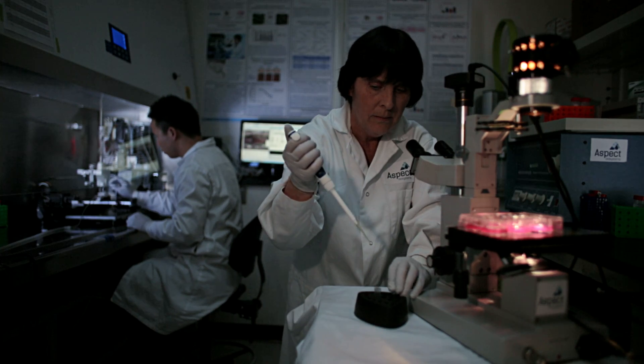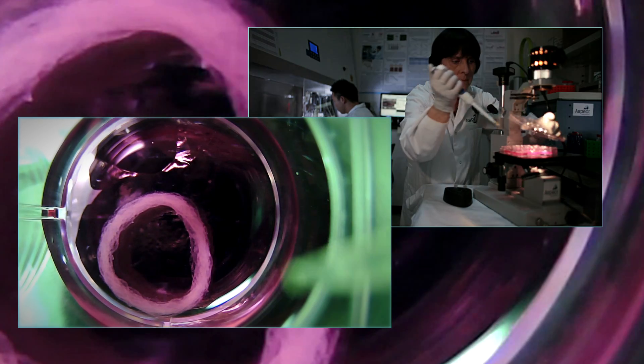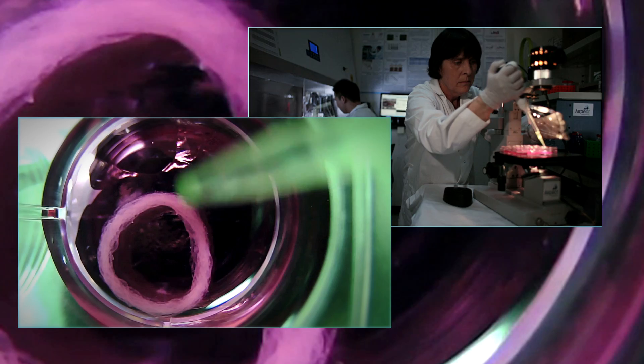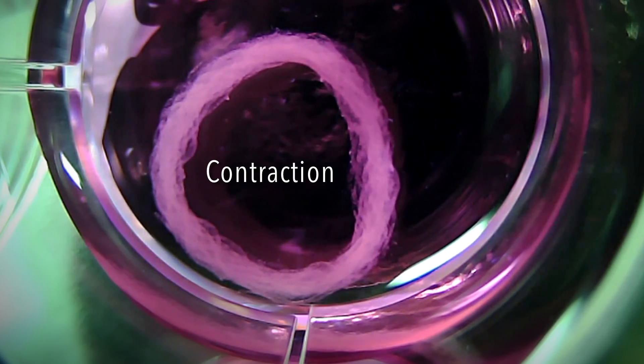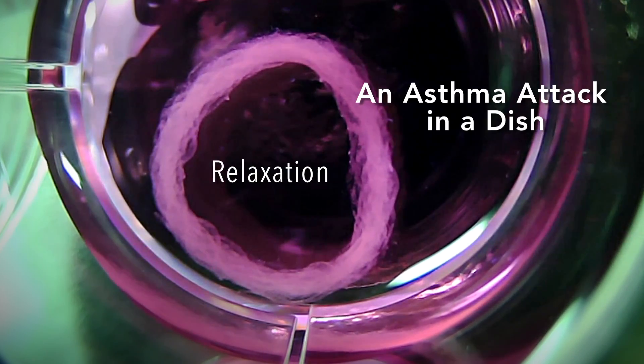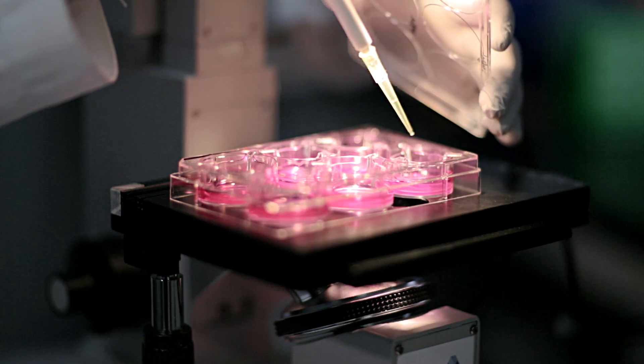The tissues we build have highly physiological functions. Here is a 3D bioring made of airway smooth muscle cells contracting in response to histamine and relaxing in response to salbutamol, recreating an asthma attack in a dish.